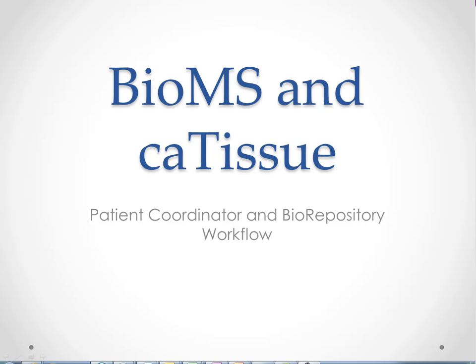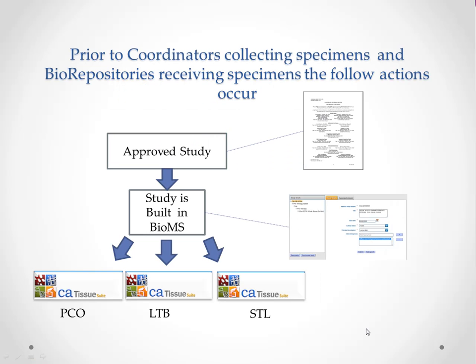This training module will cover an overview of the BioMS and caTissue applications, and the interactions between the two applications from the perspective of the CRAs and biorepository staff. Prior to coordinators collecting specimens and biorepositories receiving specimens, the following actions will occur.